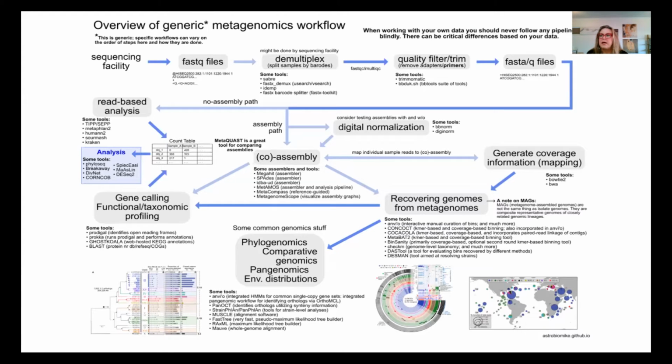The main technique that we use to characterize, so to see who is there, what they are doing, and the diversity of the microbial community, is this very complex workflow, the metagenomic workflow. We use different pipelines and different methods of characterization according to what genes or microbial community we are looking for: emerging antimicrobial resistant genes, plasmid-transferred antimicrobial resistant genes, horizontal gene transfer, or simply the structure of the microbial community.